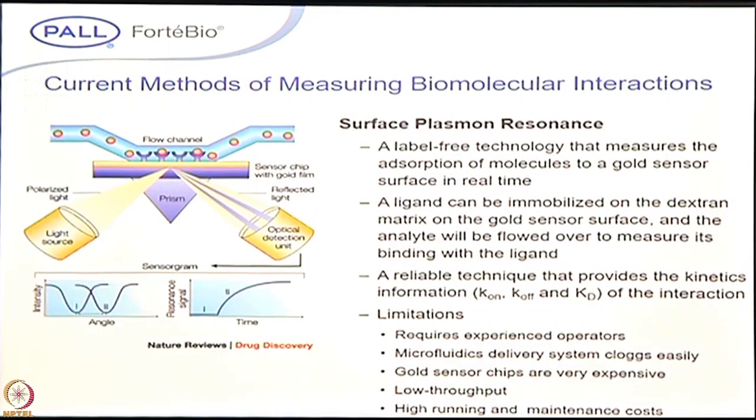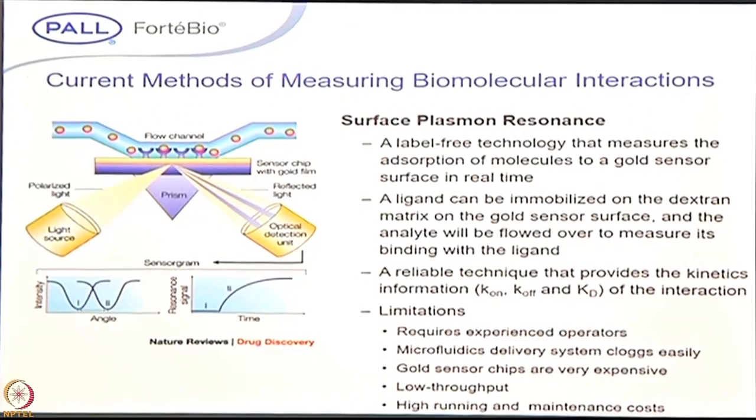The SPR technologies are real-time label-free interaction systems, where on the gold chip you have a matrix, and to that you coat one protein of interest, and then you pass the analyte through the fluidic system, and you can see the interaction change with respect to the angle. When it comes to limitations of SPR, you require a dedicated operator. Apart from that, the time required for initialization and getting to the data is tedious. It's almost a day. So you require more patience, and getting the data is more time consuming.